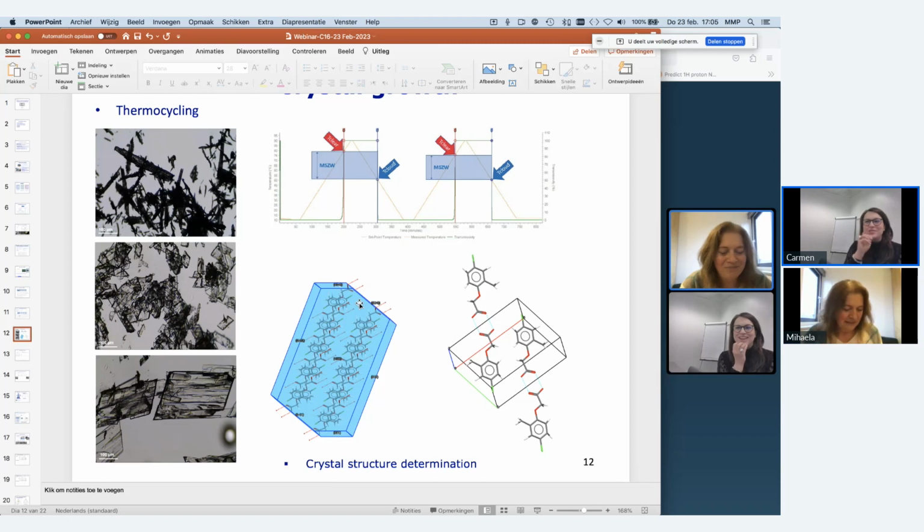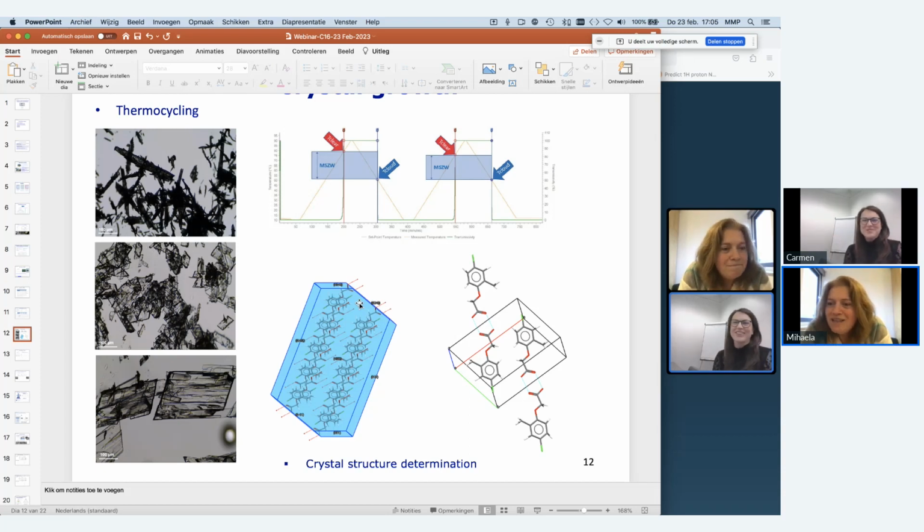Yeah. I think this was one of the first examples that you mentioned to me when I met you at Avantium. It was a compound of a customer about the salt co-crystal. See, it's coming back, Mihaela. It's beautiful to work again with you. Yeah, true, because it was in a customer project and we published afterwards. After patenting, it was published, where we found actually it was a form which was a salt and a co-crystal in the same. And it's a marketed compound.